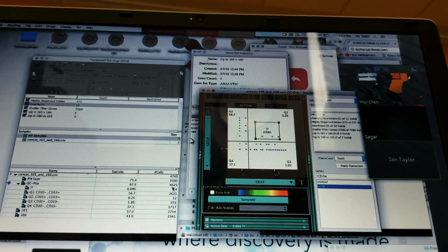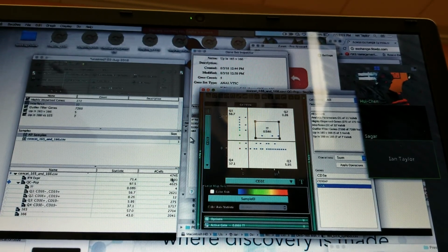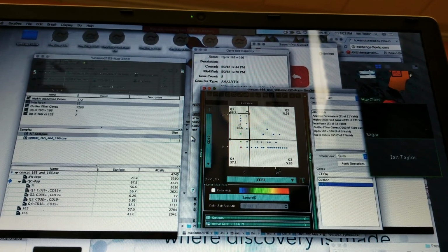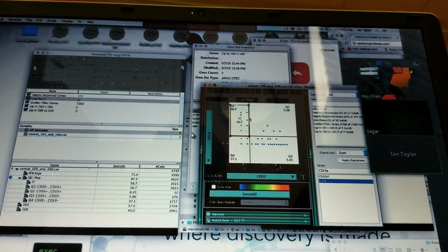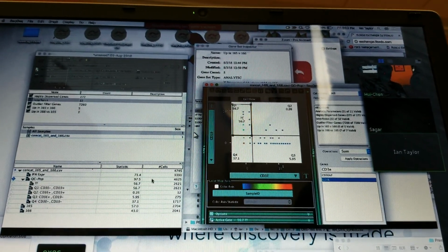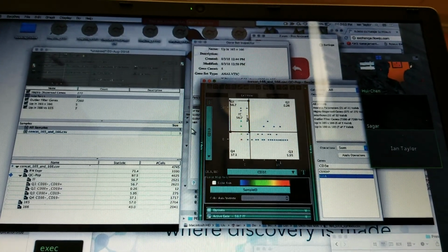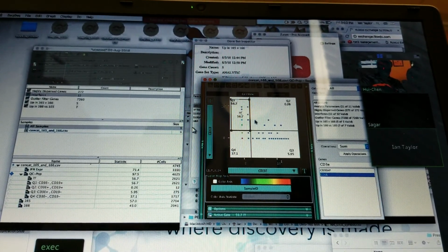For example, the gate on the CD19, if you move it over there, and you move it over there, can you make a gate of those and then make a gene or cell population? The quadrant gate automatically makes 4 gates, right? CD19 positive, CD3 negative. All right, so you already got that down there. Now, how do you get that up into the gene gate, the number of genes?